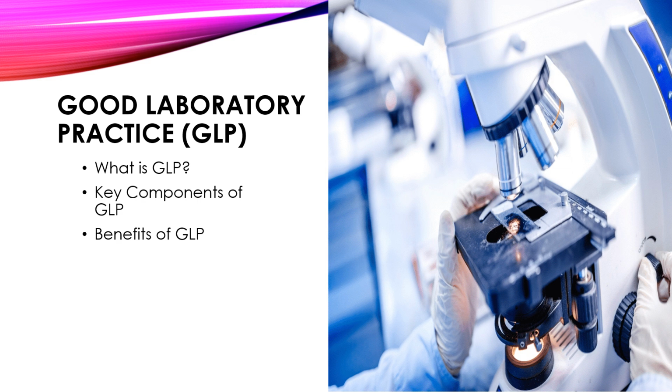Now, what are the benefits? Some benefits of good laboratory practice. The first is reliable data. Adhering to good laboratory practice ensures the generation of high quality, reliable data that can be used for decision-making purposes with confidence. Consistency in experimental procedures and documentation minimizes errors and enhances the reproducibility of results.